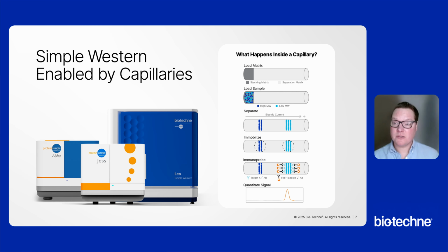The instrument starts by automatically loading the separation matrices into the capillaries. This is followed by loading of a small sample plug in each capillary. Proteins are then separated by their apparent molecular weight, like SDS-PAGE. The next step, crucial to the process, is that proteins are immobilized to the capillary wall using UV light. This allows for the removal of the inert separation materials from the capillary.